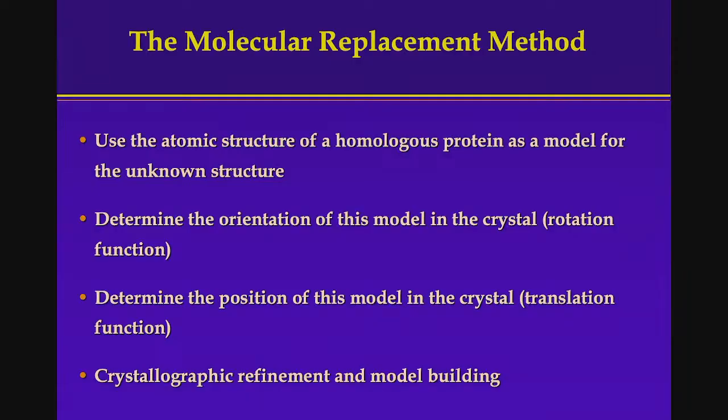So you can use the structural information from somebody else's work to determine the structure of your protein. You don't require any selenium, don't require any heavy atom. You can use direct calculation to give you the structure. But now you say, okay, what I'm working on actually had no model, no structure, nobody else worked on it. Well, that used to be a problem.